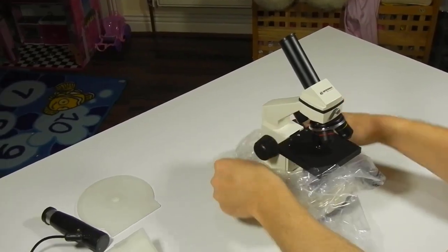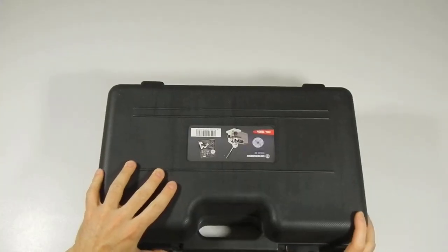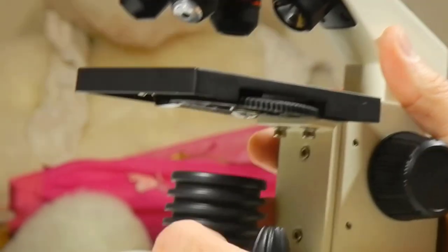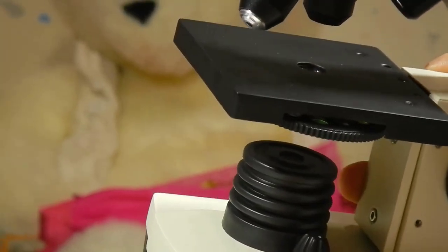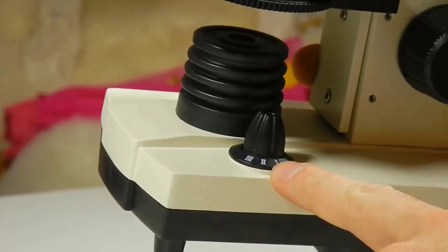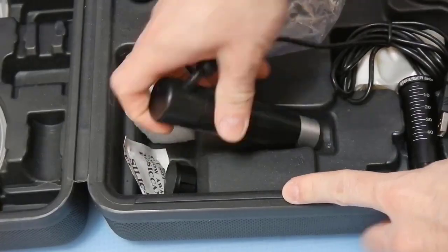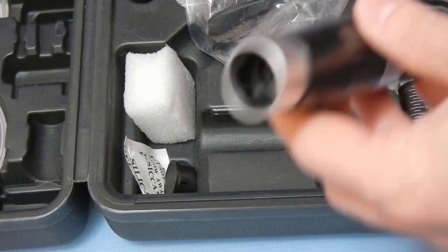including an LED lamp offering six steps of variable brightness, a filter wheel with five colors, and various filters. More excitingly still, this mid-priced metal and plastic build microscope from German brand Bresser also features a camera built-in, enabling us to preserve and study our microscopic examinations at leisure.